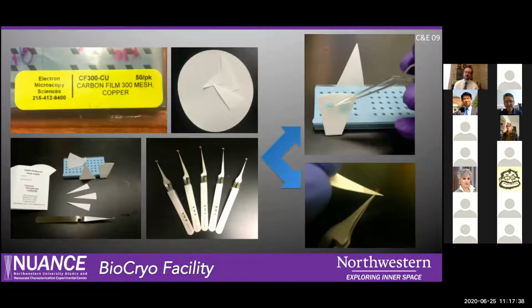I like the image right in the middle there with the fan of multiple negative action forceps, because this is very quick and you may be doing multiple experiments, so having a set of forceps can be very beneficial. Also, I like the different types of filter wedges and the ways in which they may be used. There's the very long and narrow for wicking, and then there are those that are bent.